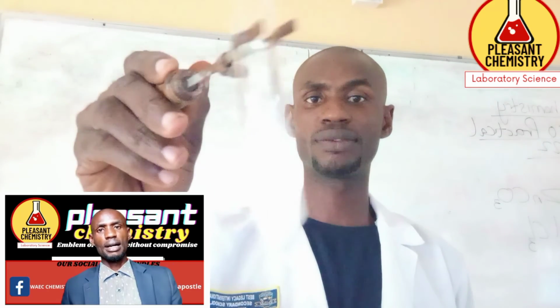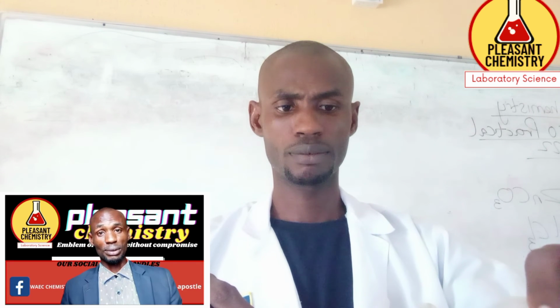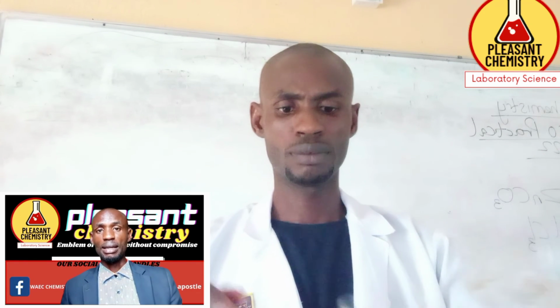We are still going to observe a white gelatinous precipitate, and then in excess, at the bottom you will see the precipitate still remains, and that shows that aluminium is present, which is Al3+. Aluminium ion is present there because it is the one that forms an insoluble precipitate with aqueous ammonia.